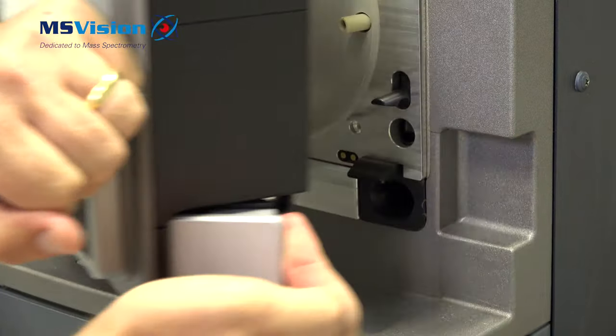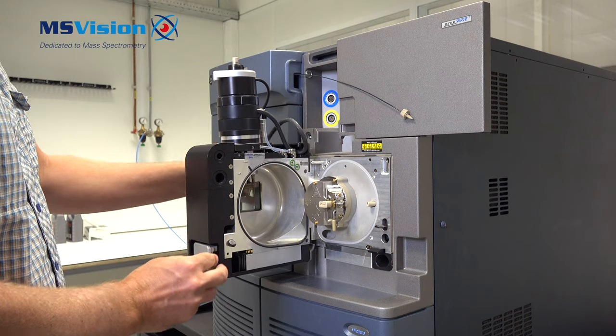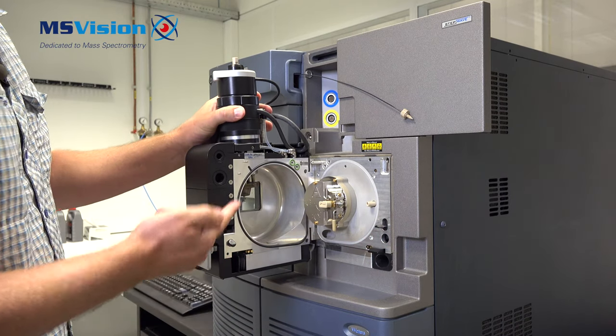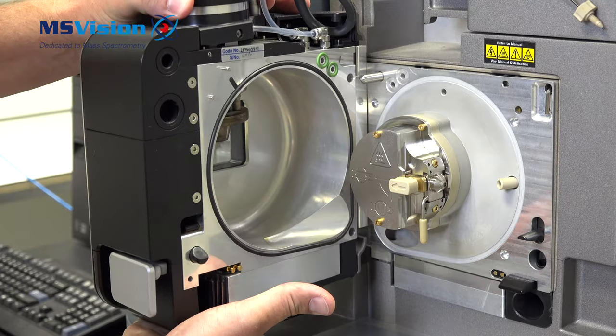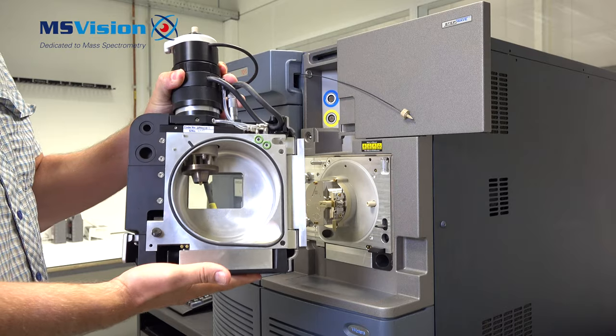Open the source enclosure door using the lever and hold with both hands. Be careful, it might be hot, at least here on the bottom side. We can remove by lifting up and then pulling towards you.